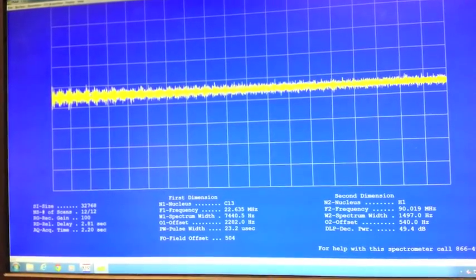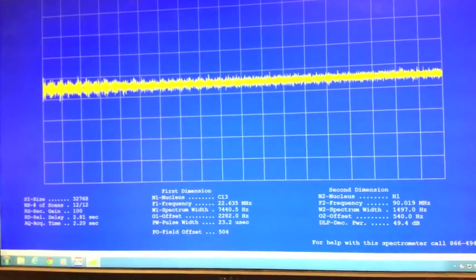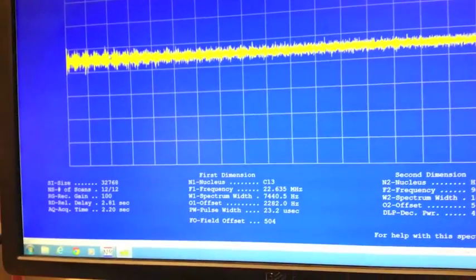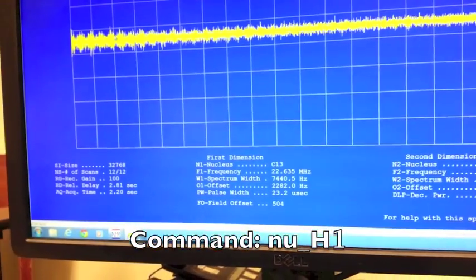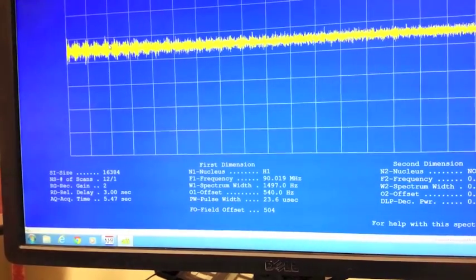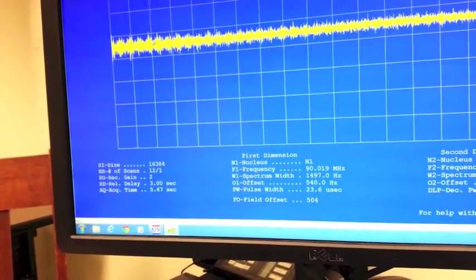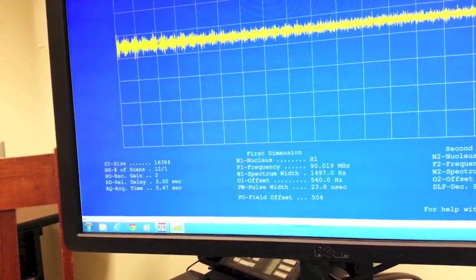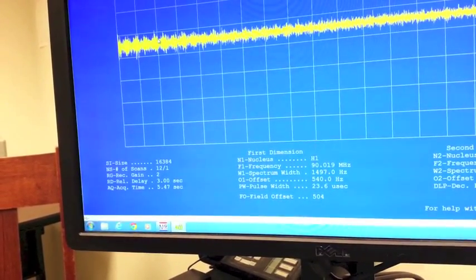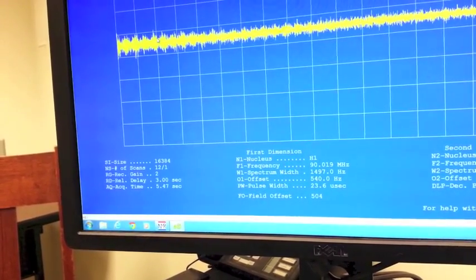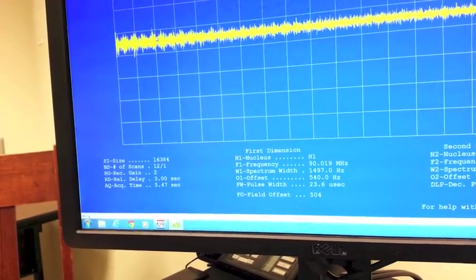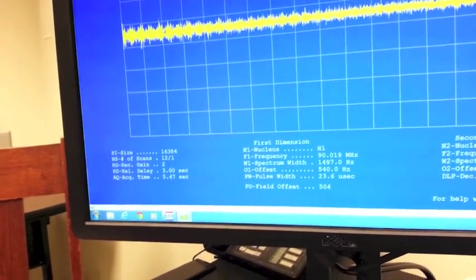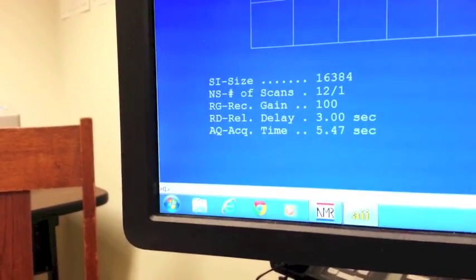To take an HNMR, the first thing you want to check is that the nucleus says H1. In our case, right now it says C13, so we're going to type in NU space H1. That will change it to H1. The next thing you want to check is the receiver gain. The receiver gain for an HNMR spectrum can be anywhere from 1 to 100. It depends on how concentrated your sample is. In our case, I'm going to change it to 100 for right now because I'm not sure how concentrated my sample is. So I'm typing in RG space 100 and enter.